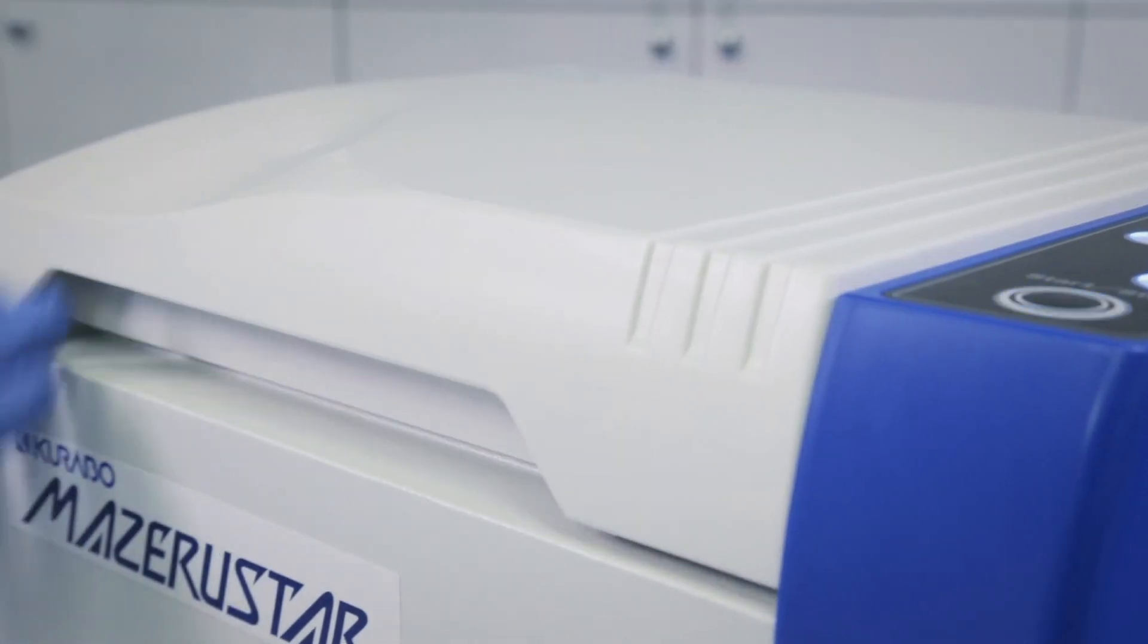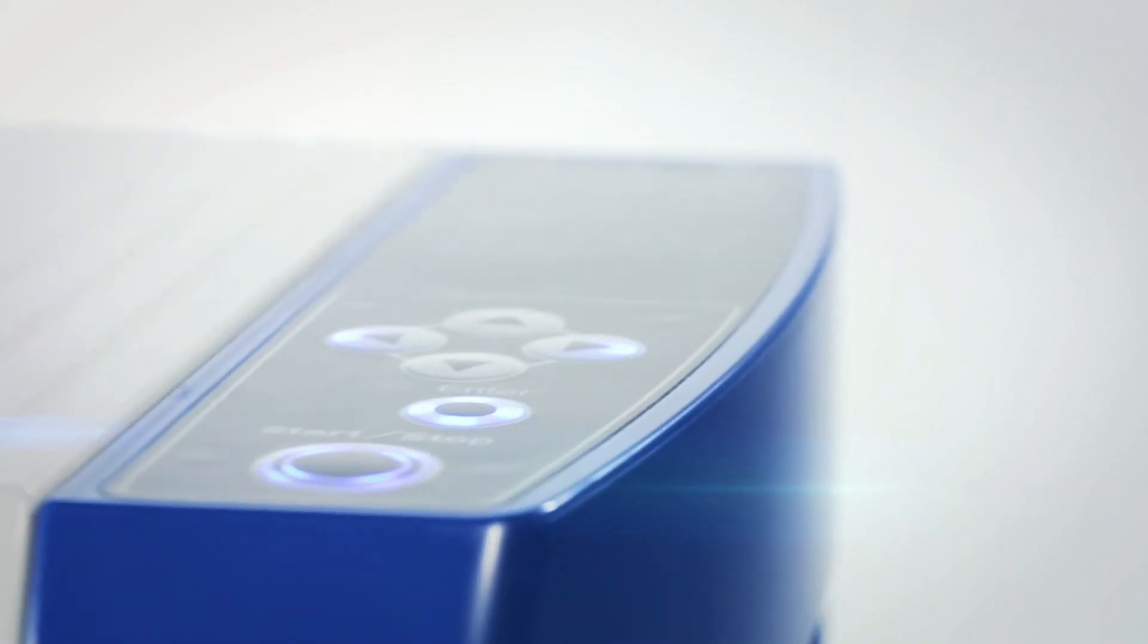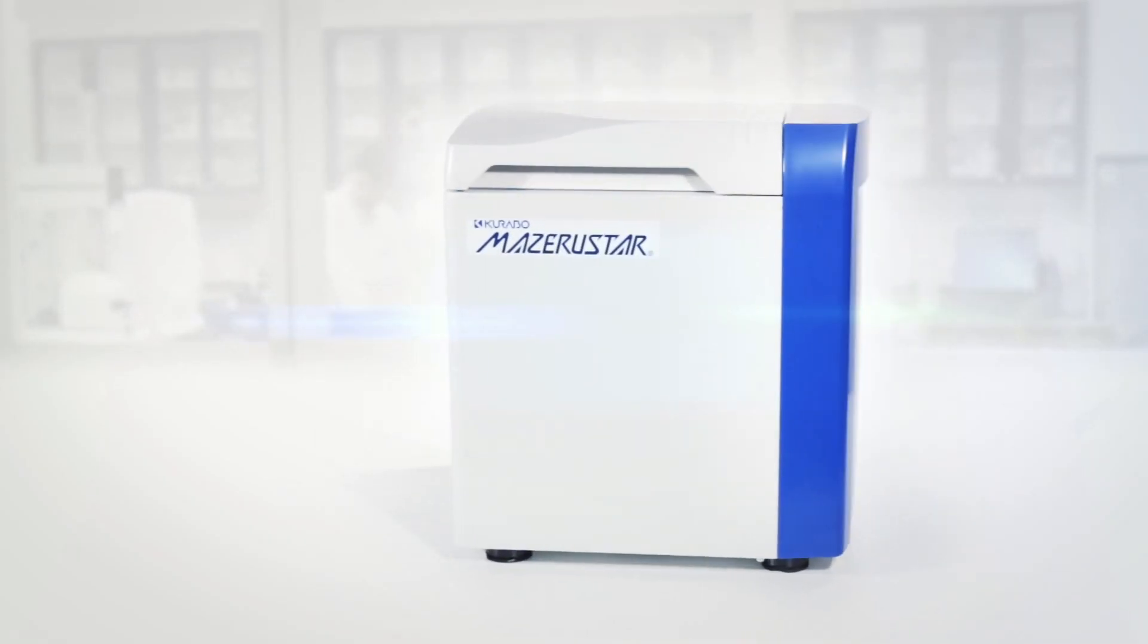No transfers, no mess, no headaches, no air entrapment. Welcome to the future of compounding.